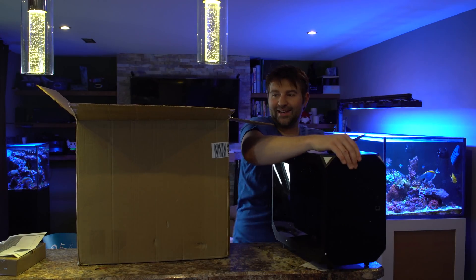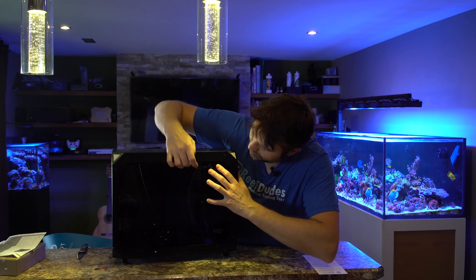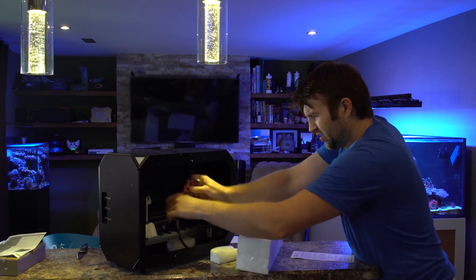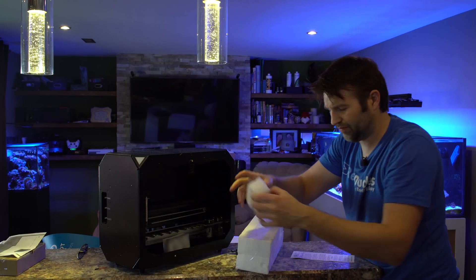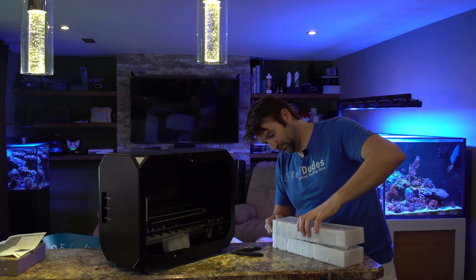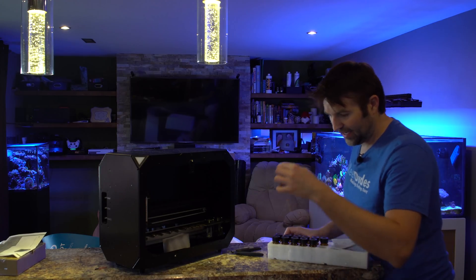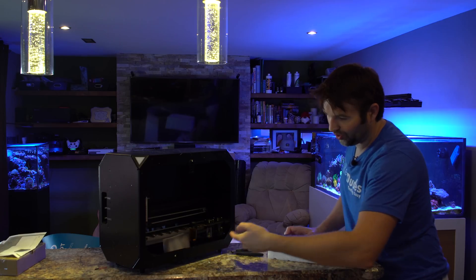Alright, we got the ReefBot. The unit itself is very sleek looking — a nice little enclosure. Let's pop open the front; we've got the rest of our stuff inside. Everything is packed inside nice and tight with little foam blocks to keep everything from moving around. Inside we have our vials — these are what we're going to put our test kits inside of. Inside each vial is a little tiny magnetic pill that sits just inside, and there's a little motor that goes back and forth along the bottom to stir it.